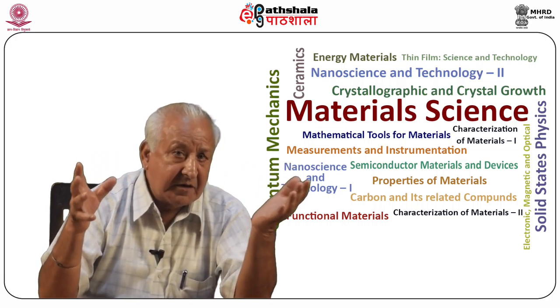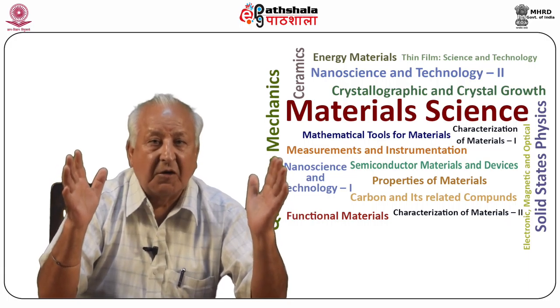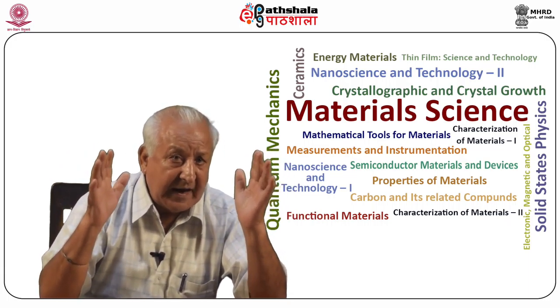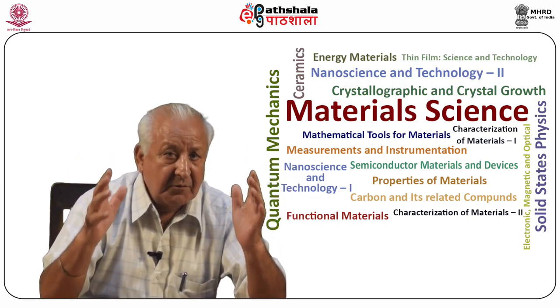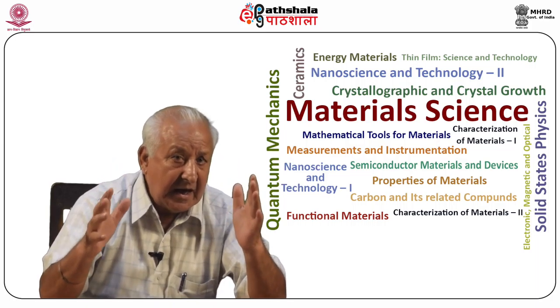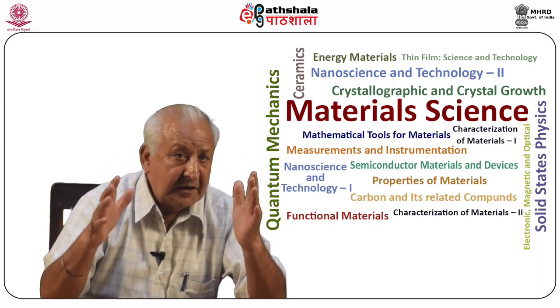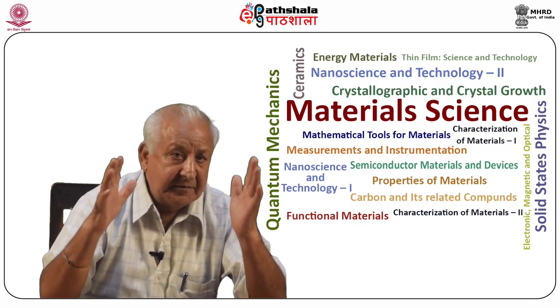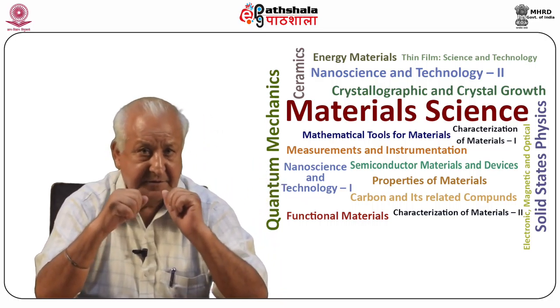Selected area electron diffraction is important in order to make use of transmission electron microscopy. The facility of SAED enables it to obtain both a visual image and an electron diffraction pattern from the very small volume of the specimen, which typically may be of the order of 1 micrometer in diameter.